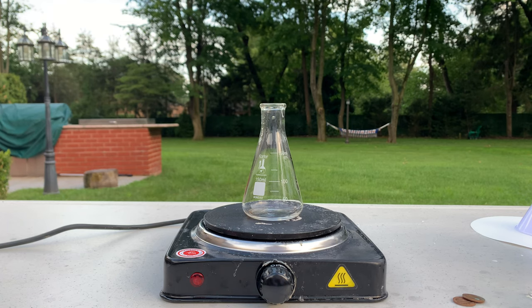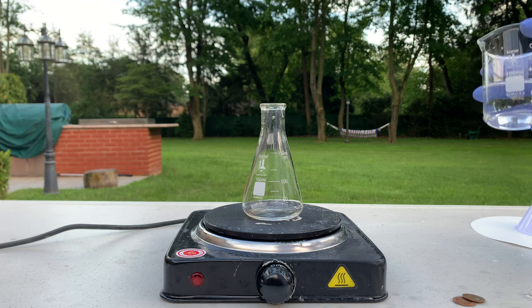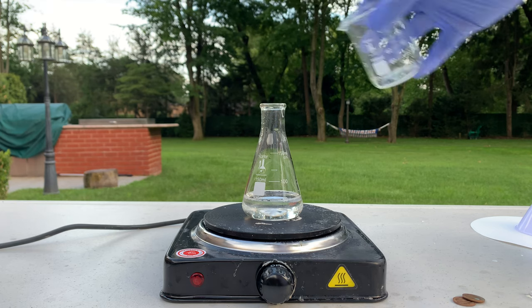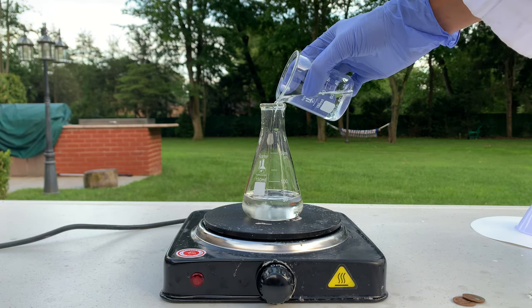I've got my Erlenmeyer flask set up on my hot plate. I'm going to start by making our first solution consisting of acetic acid and hydrogen peroxide — 50% hydrogen peroxide and 50% acetic acid, which is just white vinegar. We'll start by adding 50ml of hydrogen peroxide and then 50ml of white vinegar. This is the hydrogen peroxide — just around 50ml of 30% hydrogen peroxide. And now measuring out around 50ml of white vinegar.